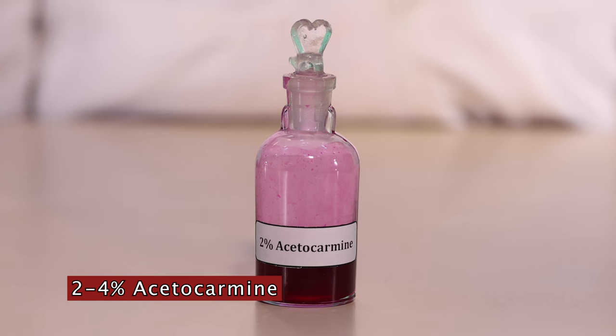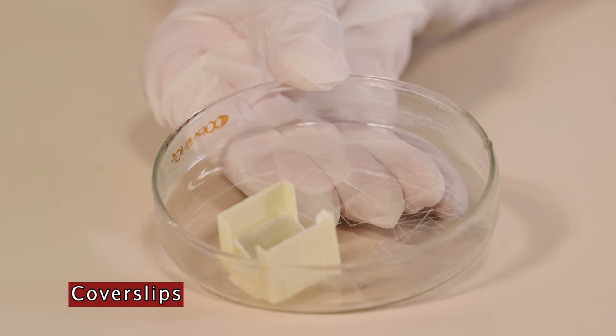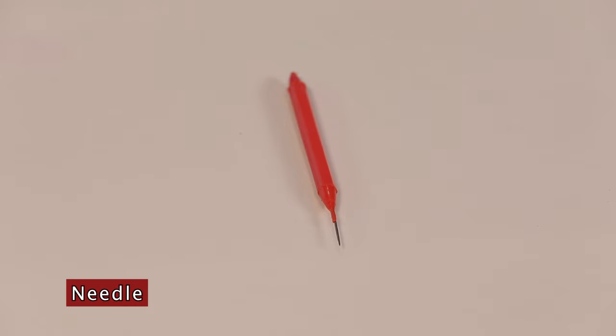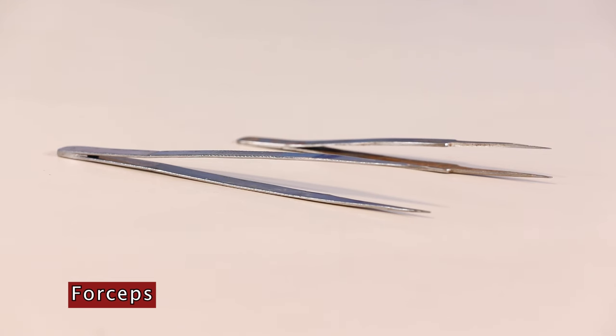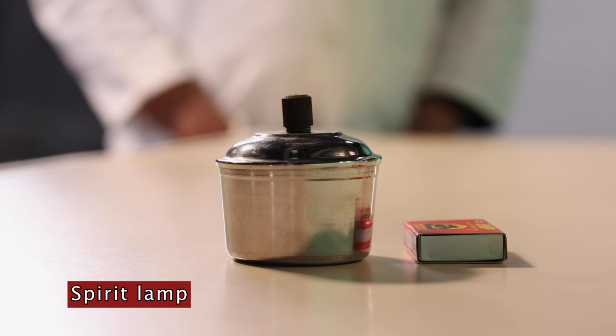Let us study staining of nucleic acid by acetocarmine. The materials required are onion bulb, 2 to 4 percent acetocarmine or aceto-orcein stain, slide, cover slip, brush, needle, forceps, knife, blotting paper, spirit lamp, matchbox and compound microscope.